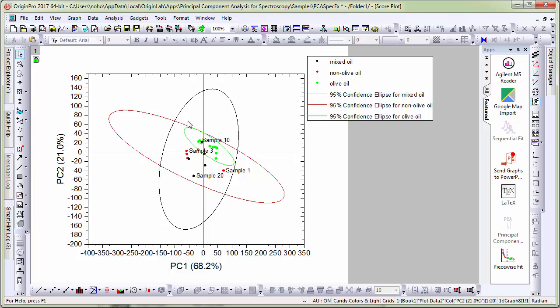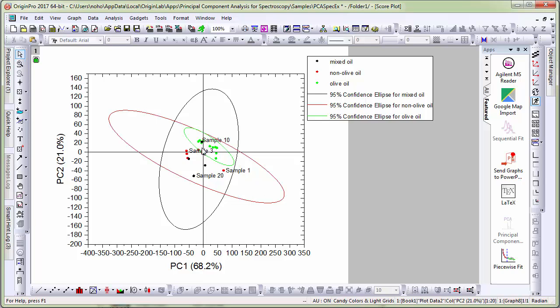And from the confidence ellipse and the scattered data here you can clearly see that the olive oil group is very nicely separated which is the green scatter points whereas the mixed oils and non-olive oils overlap fairly.